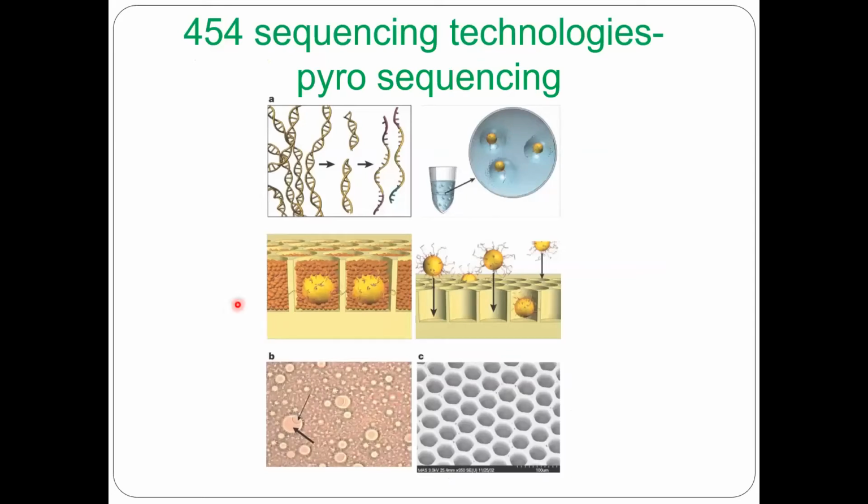And this picture describes the whole flow of pyrosequencing. This picture alone is enough, but we need to understand what is going on in each step. I'll try to explain every step, so try to listen. I'll use my whiteboard for explaining.